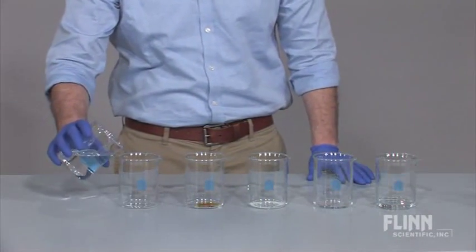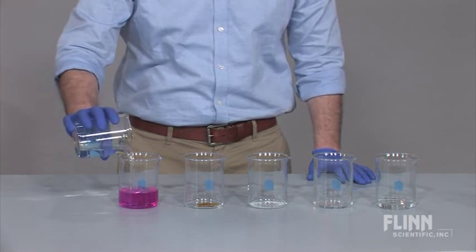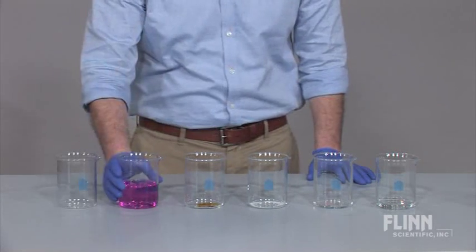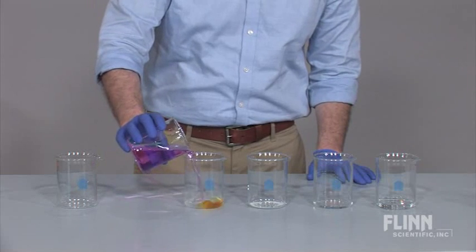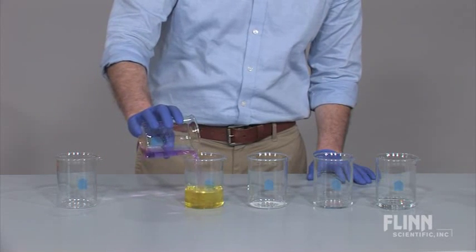Water plus phenolphthalein poured into dilute sodium hydroxide produces purple grape juice. Pour the grape juice into a beaker with sulfuric acid and a few drops of food coloring to form lemonade.